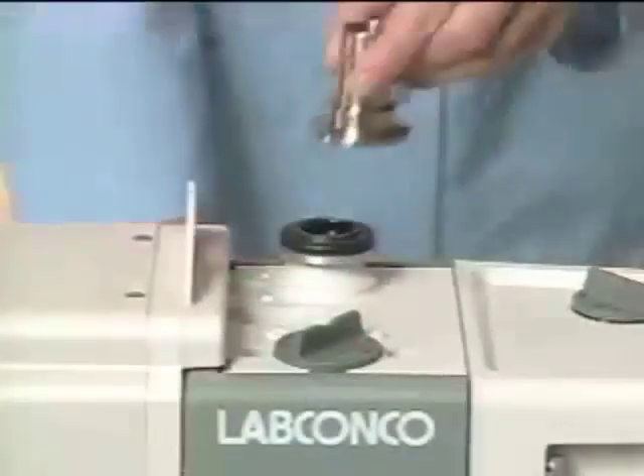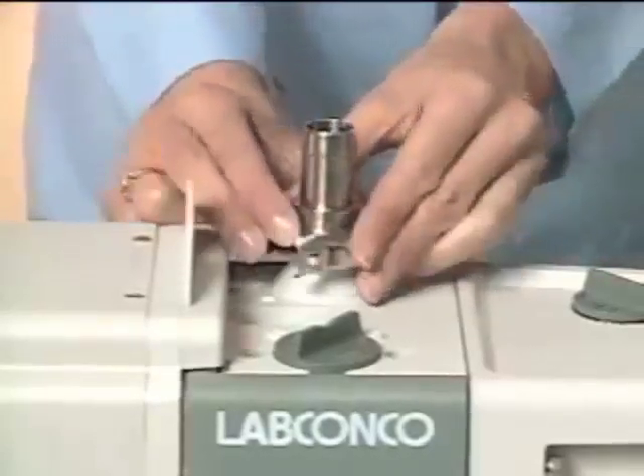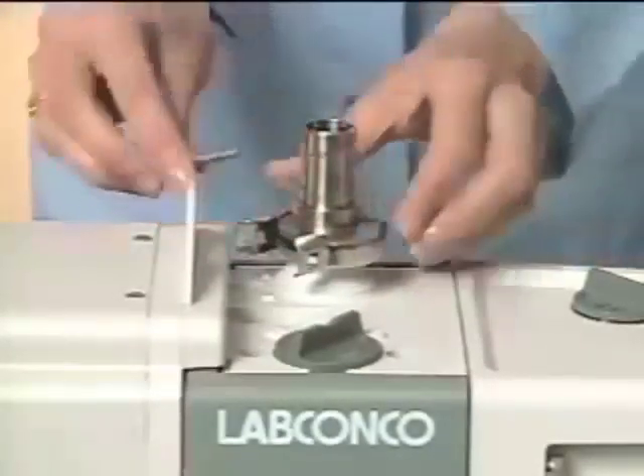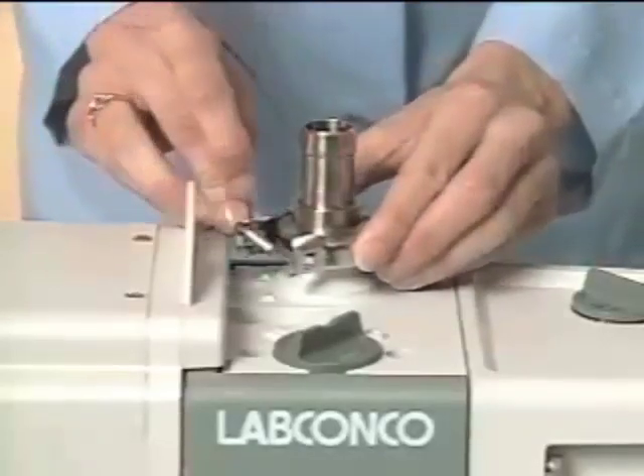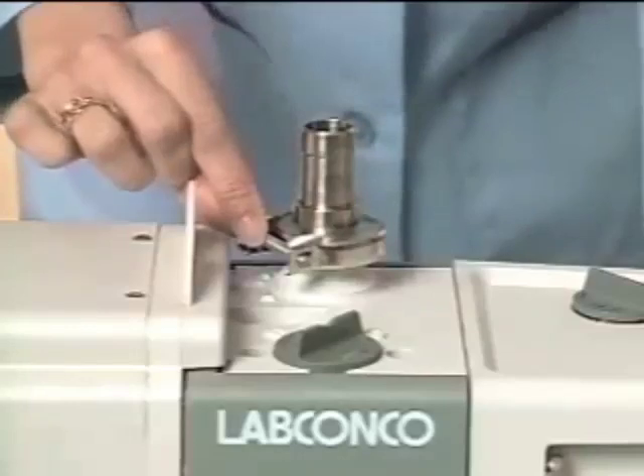Now add the inlet adapter. Remove the dust cap and place the three-quarter inch hose adapter onto the existing centering ring and filter assembly. Place the clamp around the adapter and the inlet port and tighten for a good seal.